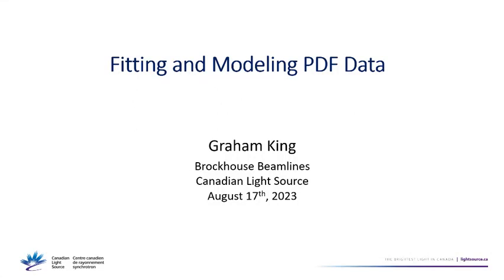I'm Graham. So now that Al has explained what a PDF is, I'm going to build on that and explain how you get structural information out of a PDF once you have one. So my talk is all about fitting and modeling PDF.